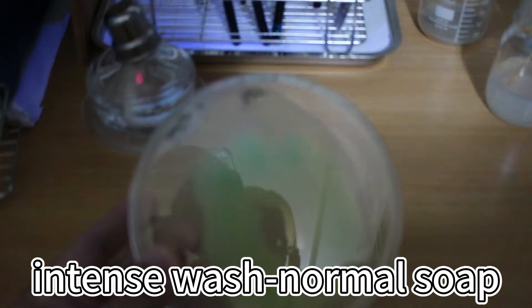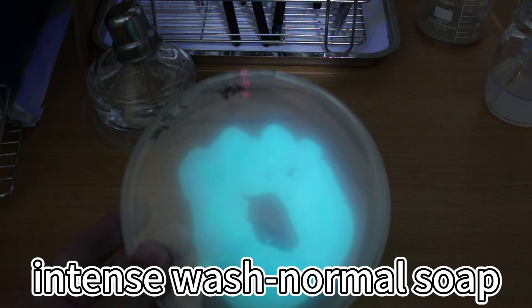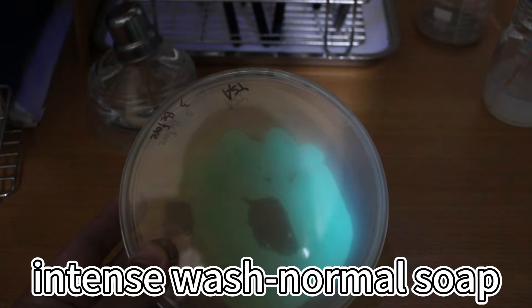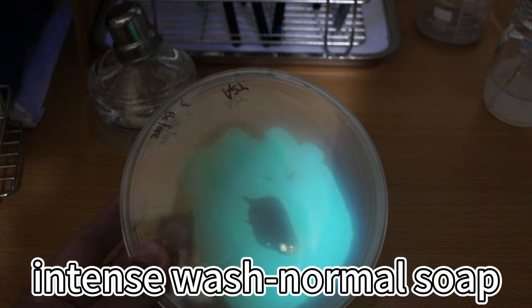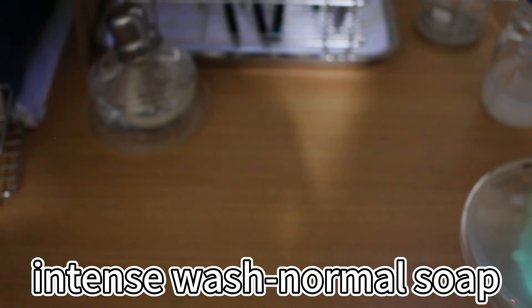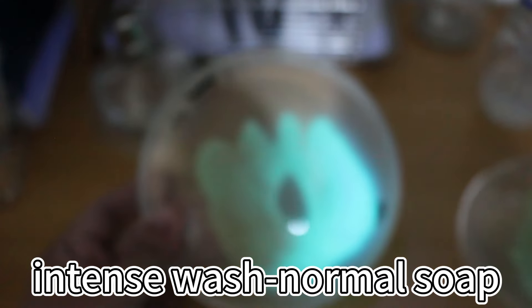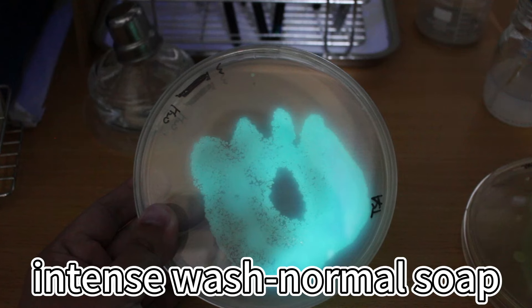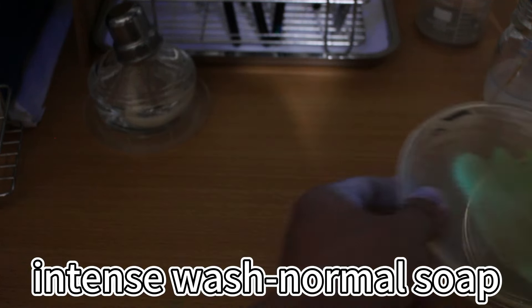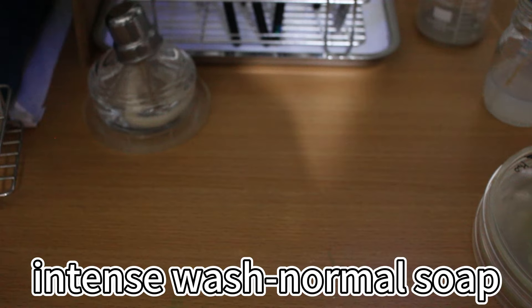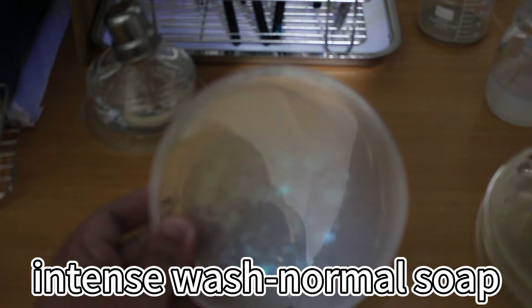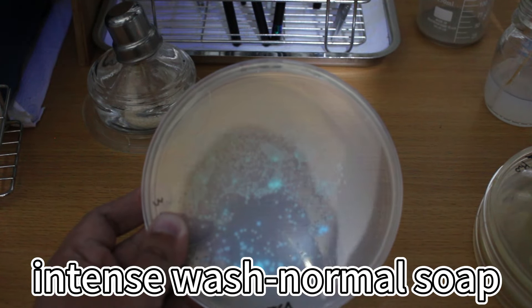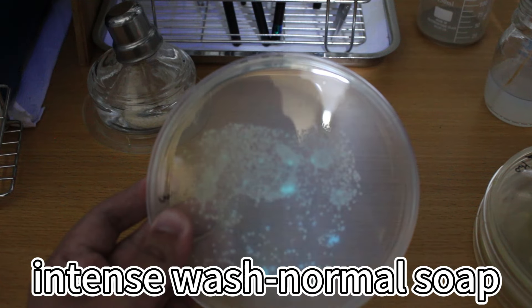Now we can look at the high intensity wash group, which this is before wash. After water rinsing. And after intense wash with normal soap. You can see some glowing colony.